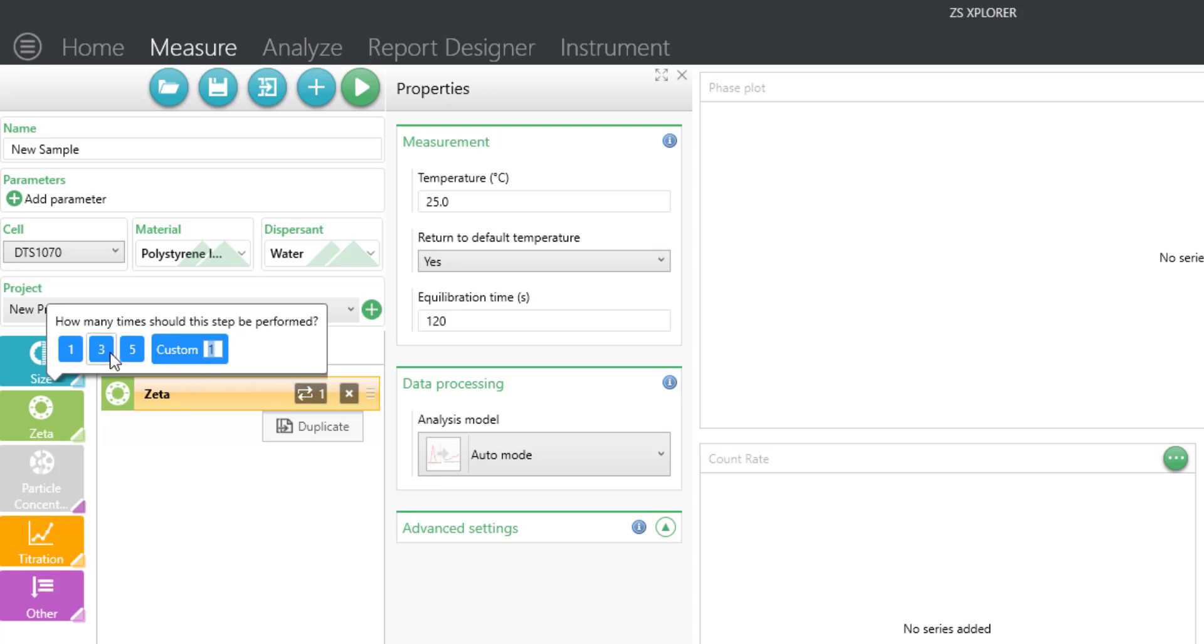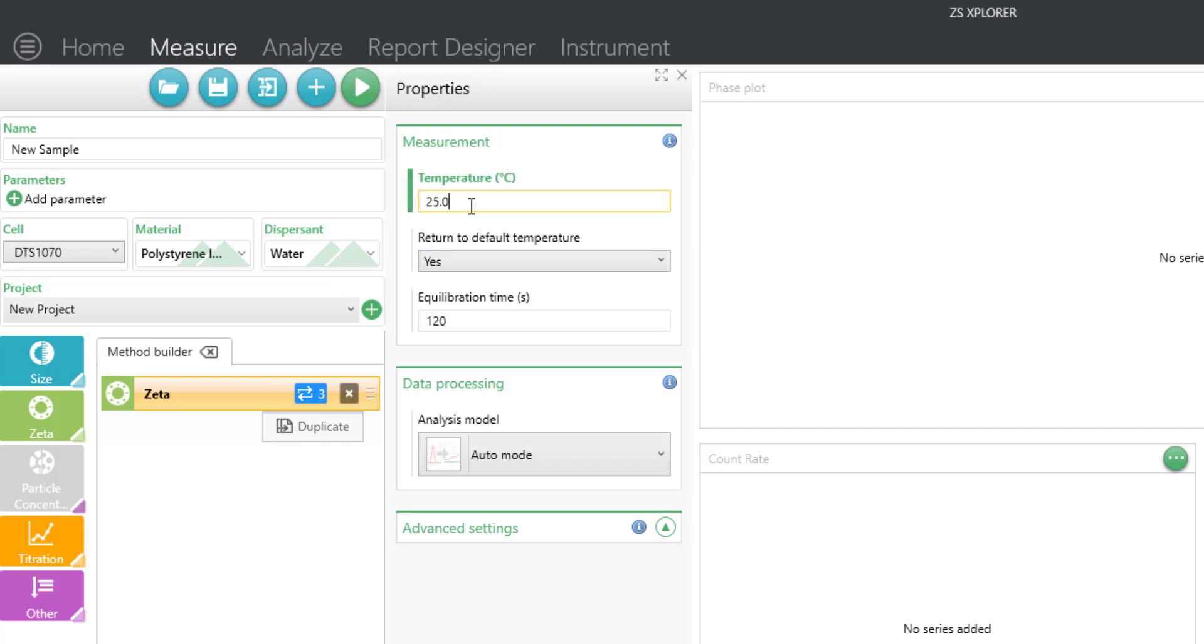Next, type in your measurement temperature, which can range from 0 to 70°C for zeta potential analysis. Add in any necessary equilibration time to bring the sample to the instrument temperature. Our default is two minutes, but this can be adjusted.